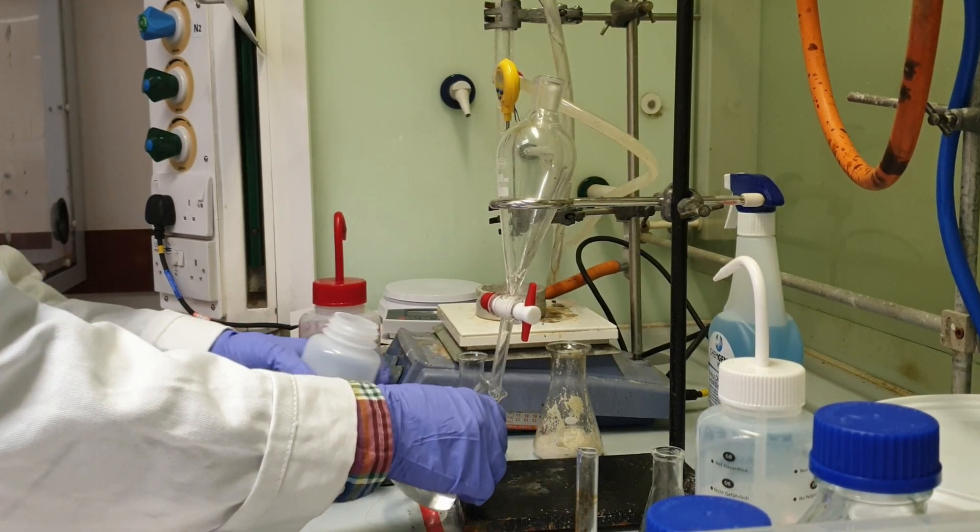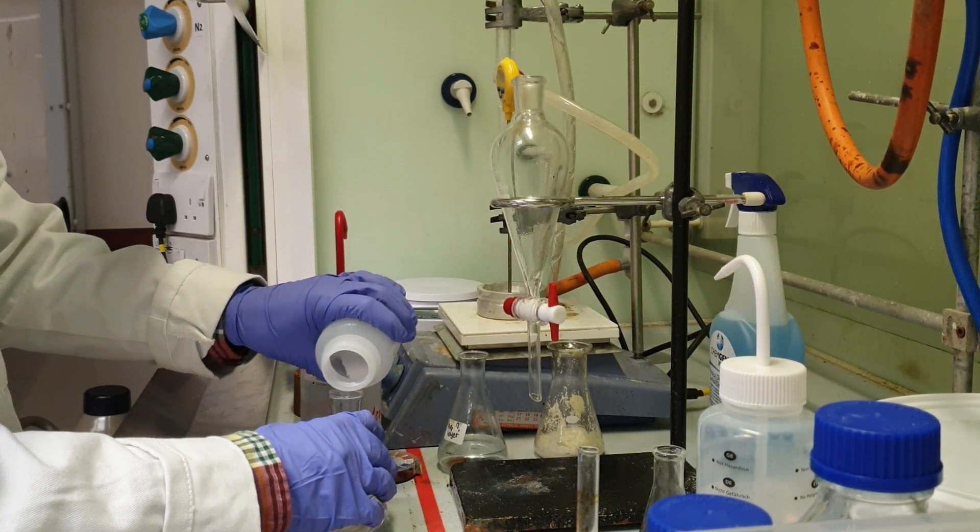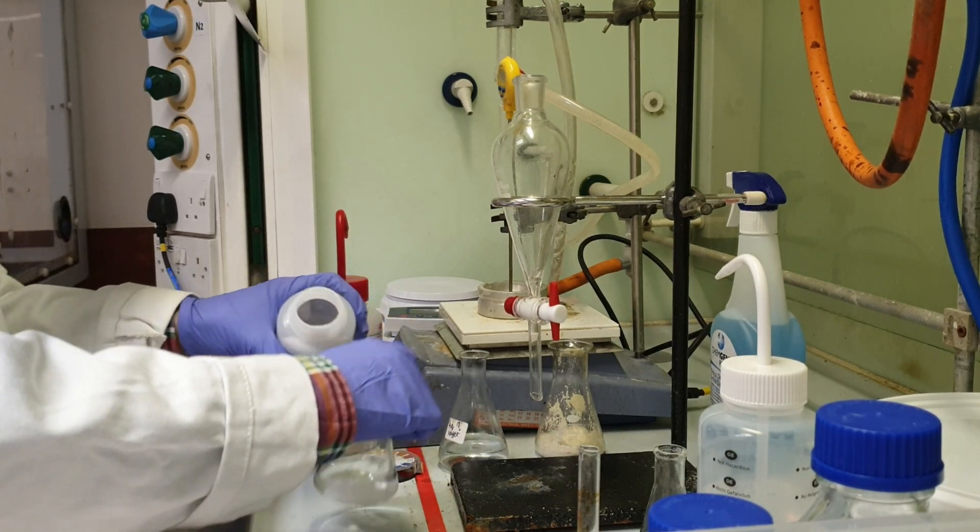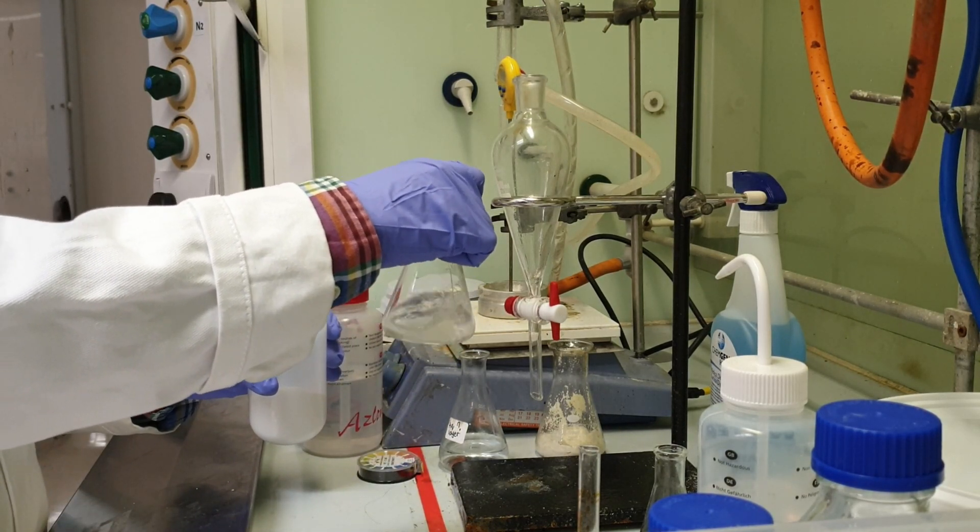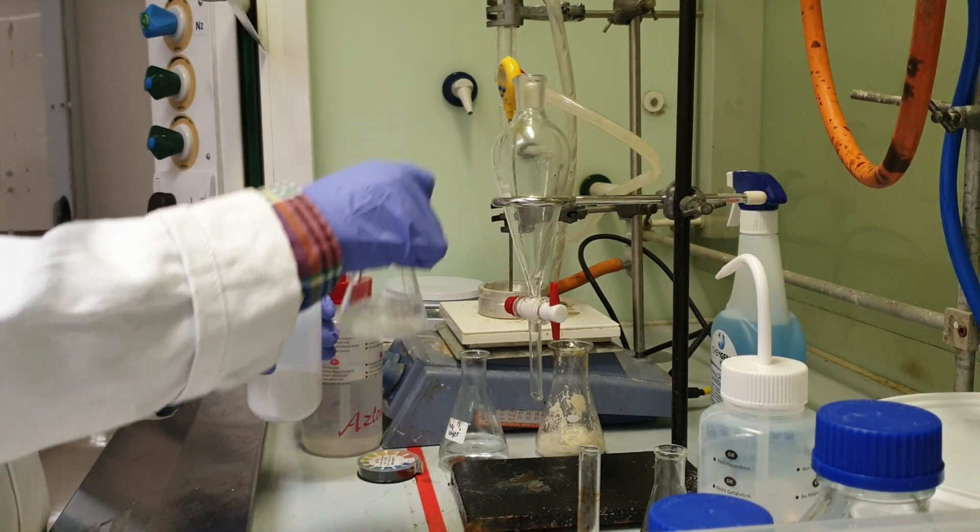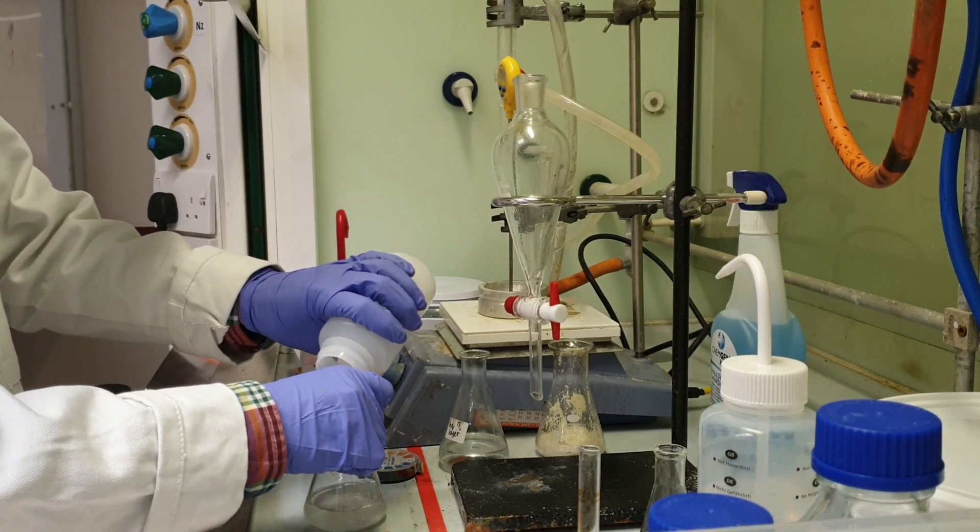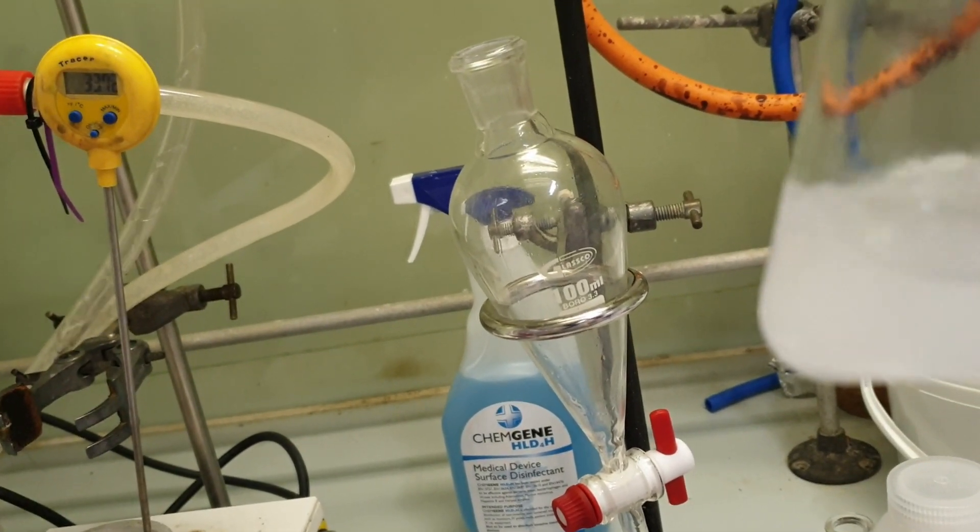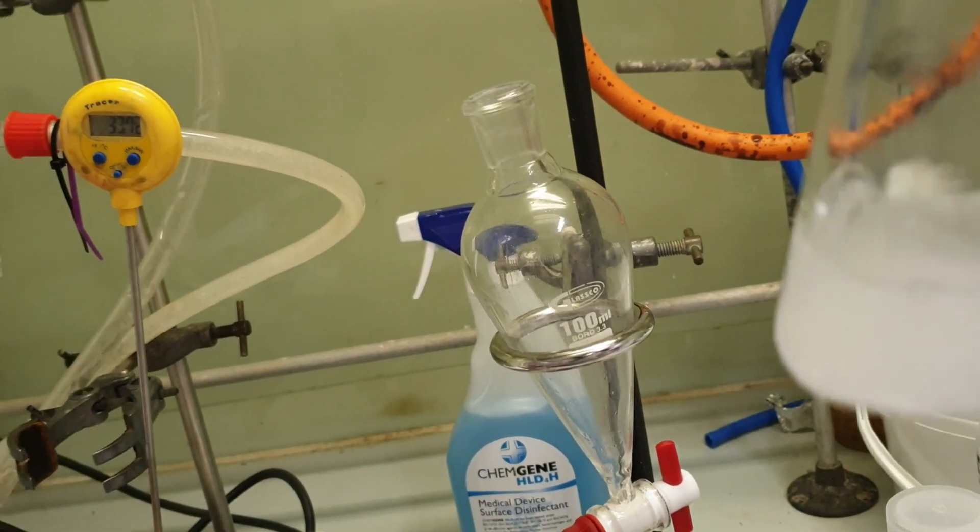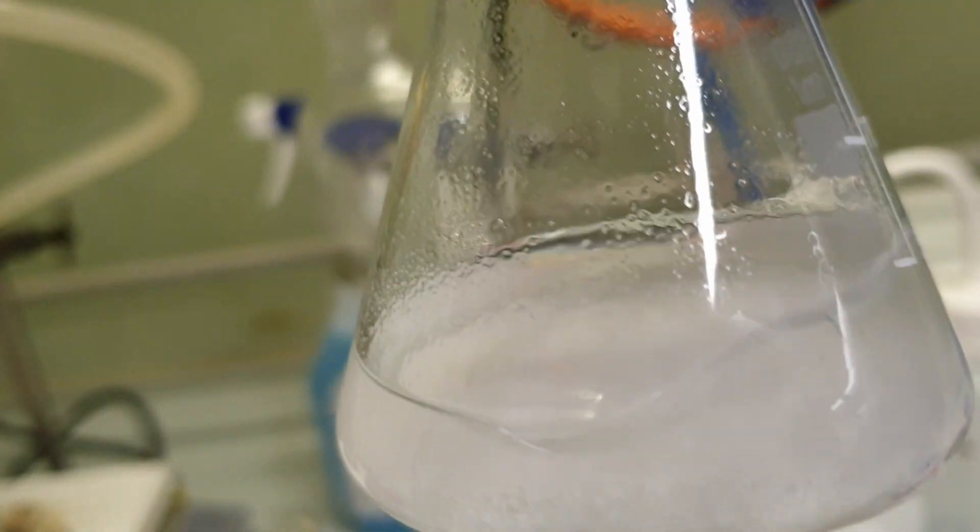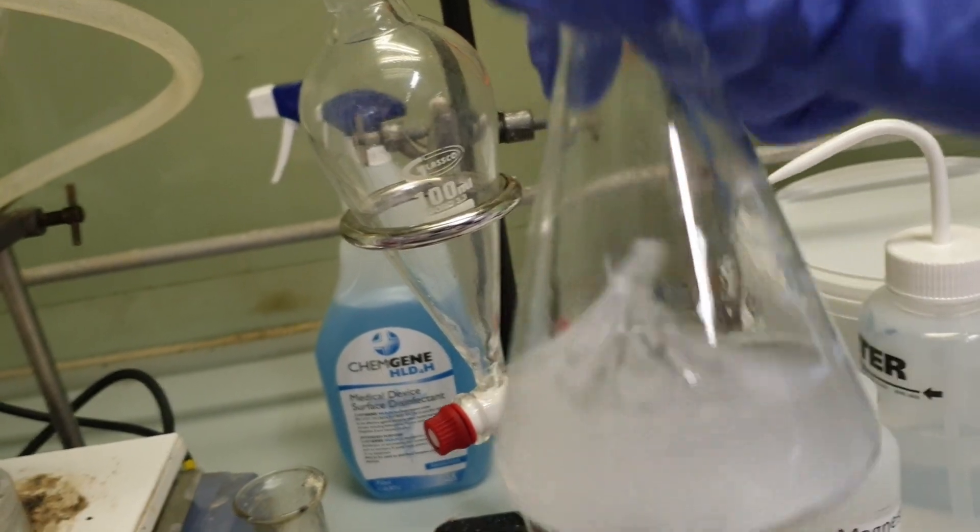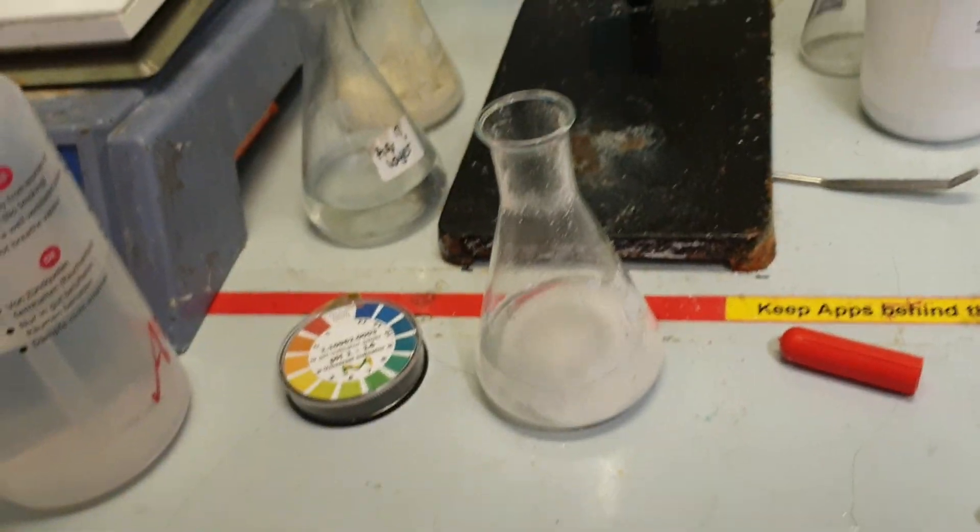Here I am adding anhydrous magnesium sulfate to my now neutralized organic layer. This will absorb water, any remaining water from the organic layer. This is dry now because when I swirl it, it goes cloudy but that means that not all of the magnesium sulfate has clumped at the bottom. So that's good to go. Just need to gravity filter this now.